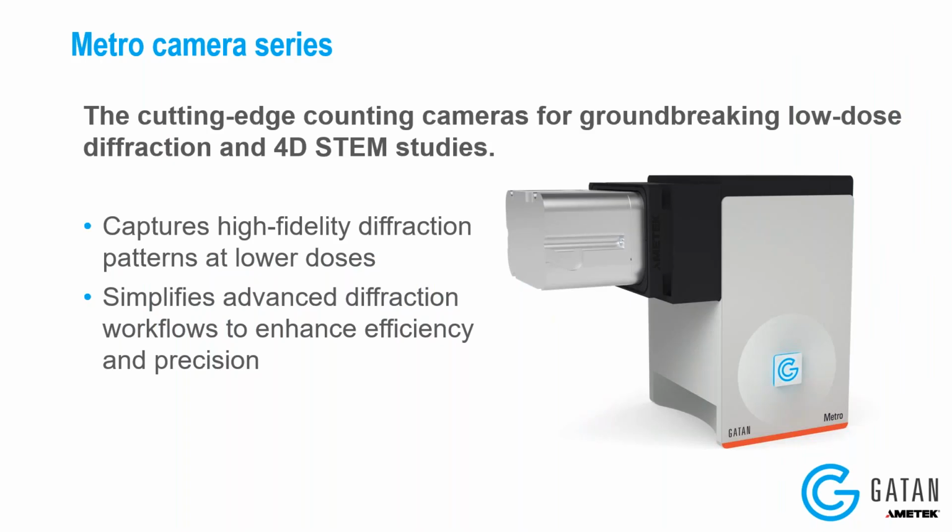There are two main divisions in my presentation that we'll look at. The first, I'll talk about how we can capture high fidelity diffraction patterns, specifically at lower dose rates on the camera, but also on the sample.